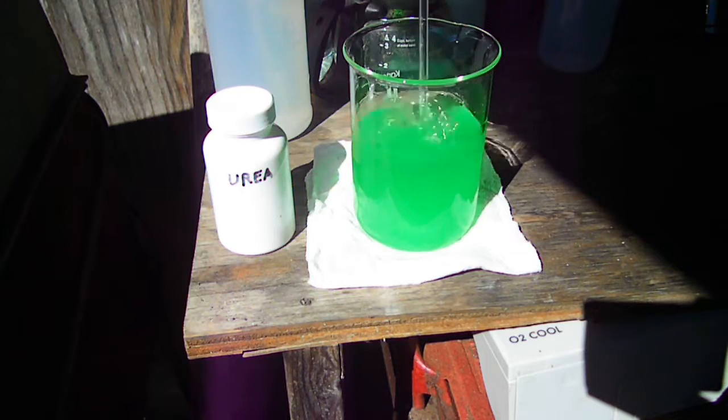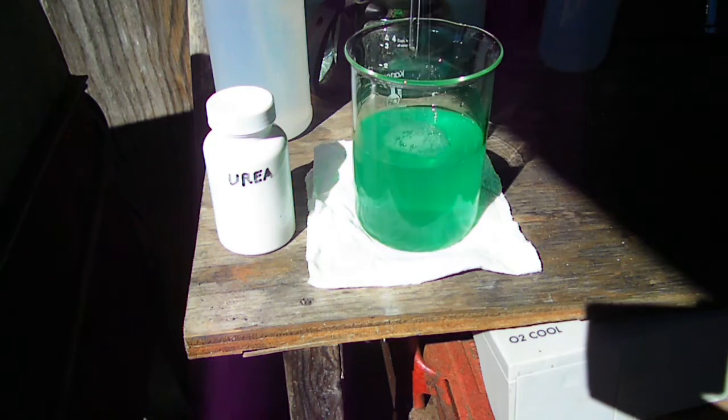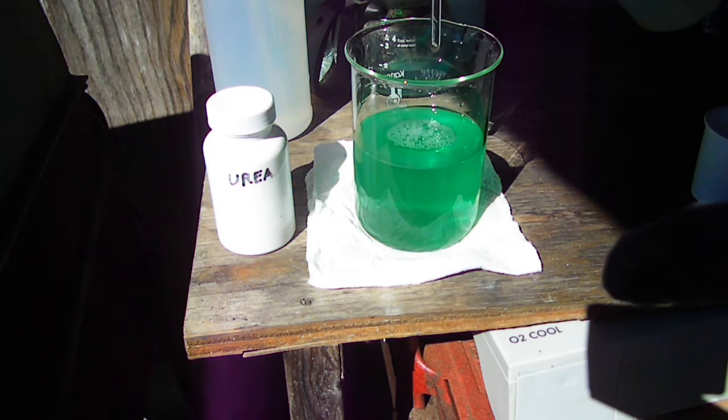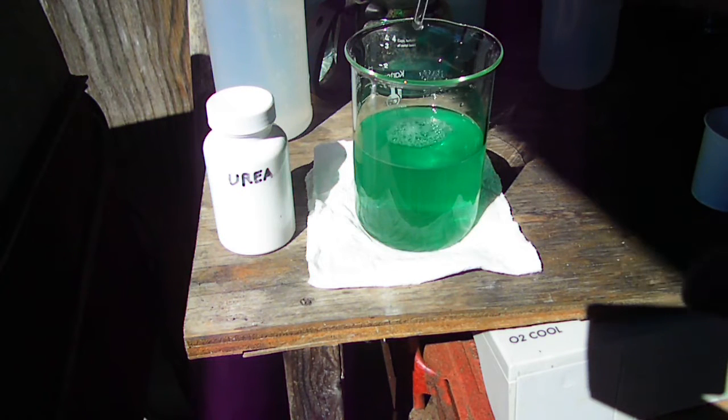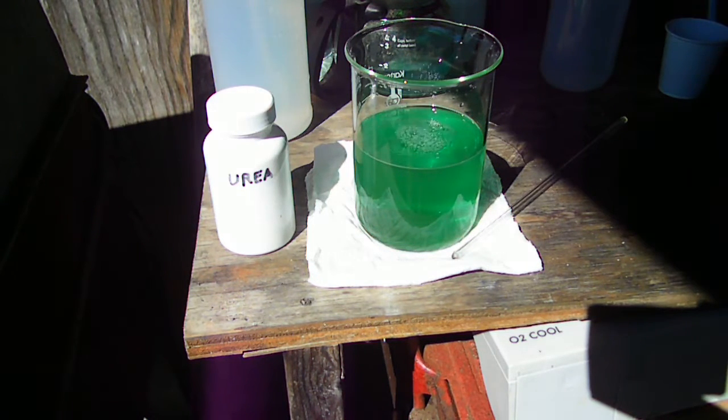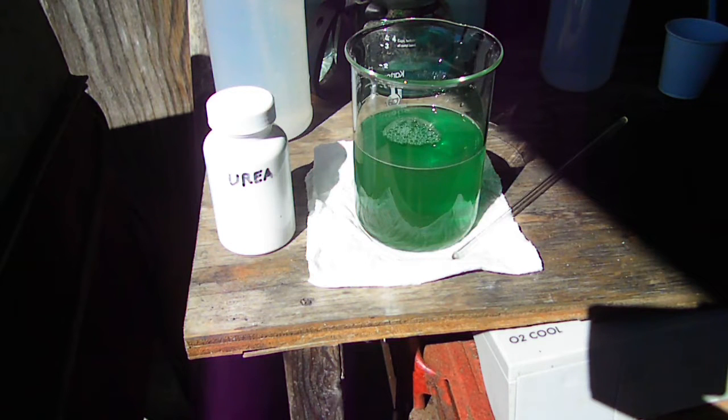It's cold, so the reaction is going to take longer. So I'm going to just wait it out. See if we get a drop. If we don't get a drop, then there's very little gold in all that. It looked like there was going to be quite a bit, but I'm starting to see it change now a little bit. We may not see a lot of color change just simply because it's so cold and it's going to take a while.